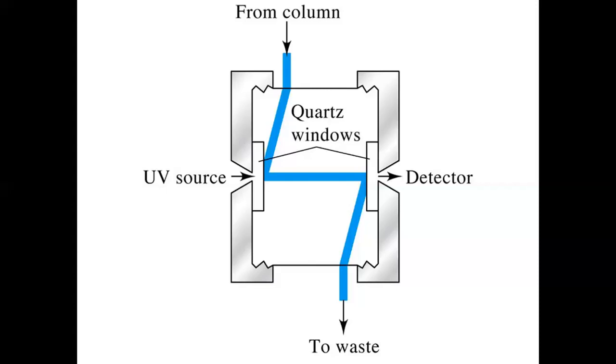So even a negligible absorbance can be made to an acceptable absorption value if we increase the path length b. The error while measuring the absorption can be minimized by simply increasing the path length of the cell. Therefore, the Z-shaped cell is used in the detection of the solute molecule while using UV absorption detectors.